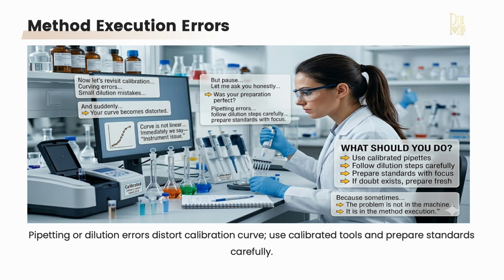So what should you do? Always use calibrated pipettes. Follow dilution steps very carefully. Prepare standards with focus. If doubt exists, prepare fresh, because sometimes the problem is not in the machine, it is in the method execution.